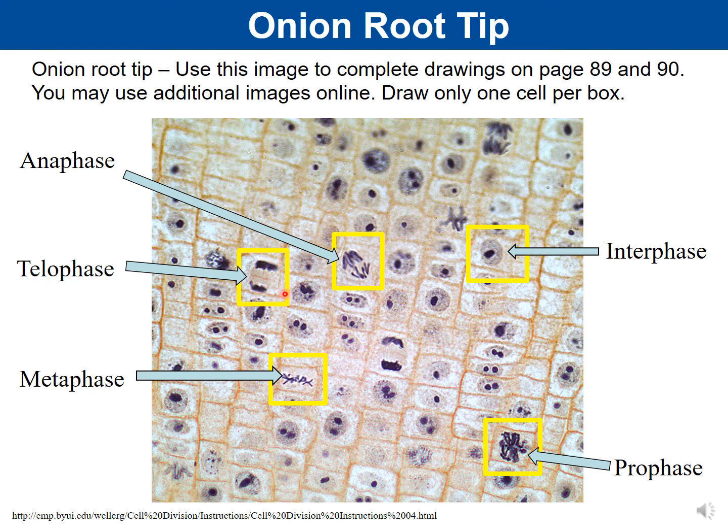Again, our cell wall, cell membrane is the outside of this little box. Again, the cell plate is that line. These orange lines coming from the chromosomes and into the cell plate, those are the spindle fibers. So that's where you would label the spindle fibers, etc.